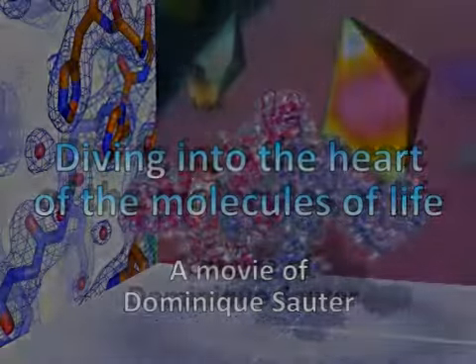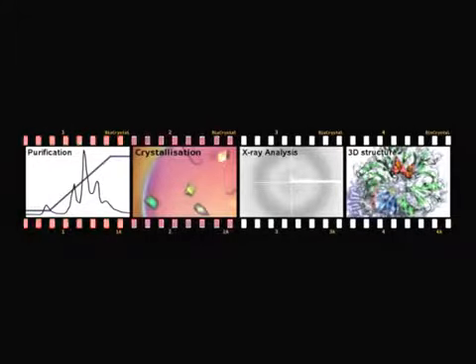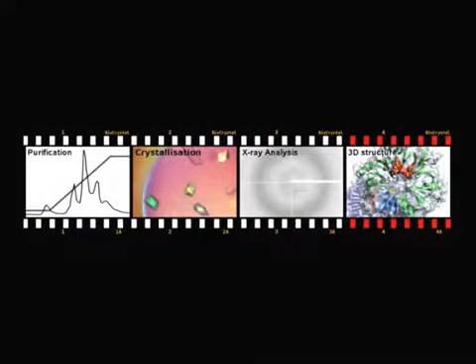interact. During this film, we will see the steps that lead to the visualization of a biological macromolecule in 3 dimensions. This image or 3-dimensional structure allows us to appreciate the shape of a molecule and better understand its role inside a living cell.